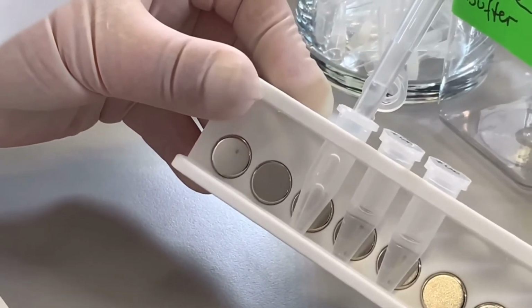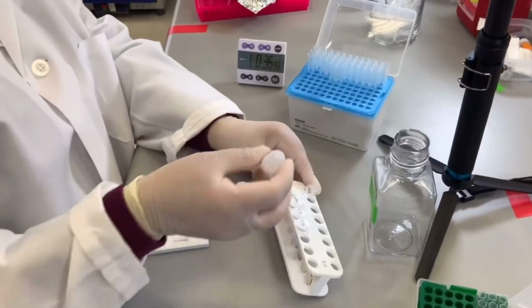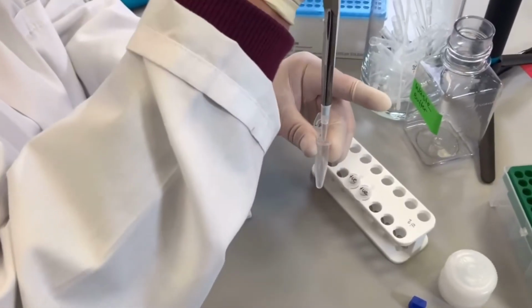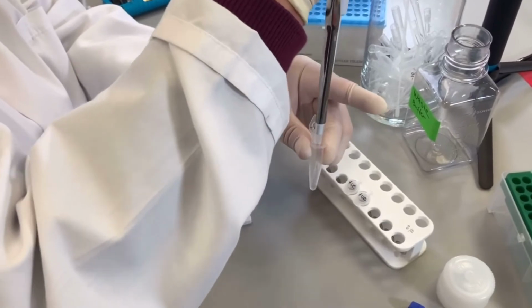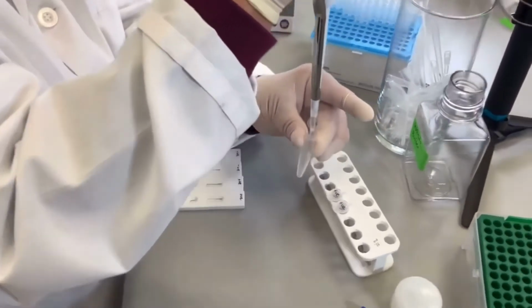We insist on the word gently. When decanting, place the pipette tip close to the wall opposite of the magnet to not disturb the particles. Wash the particles from the side wall of the vial and mix gently by pipetting several times. Do not be too vigorous. You do not want to create foam.